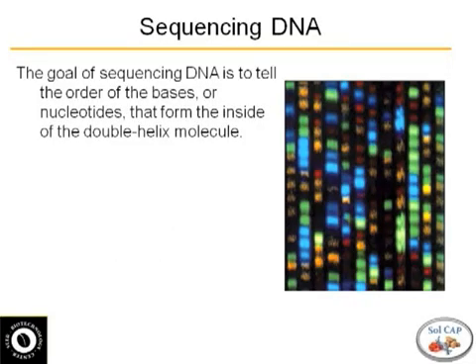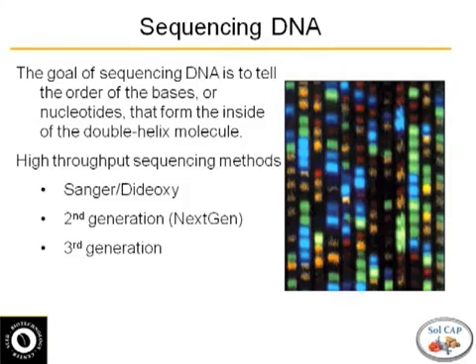So with sequencing, unfortunately, we don't have a technology right now that can take a DNA molecule and sequence it from one end to the other. So what we end up doing is we chop up the DNA and we try to put it back together. And that has some issues, and different technologies handle that in different ways.